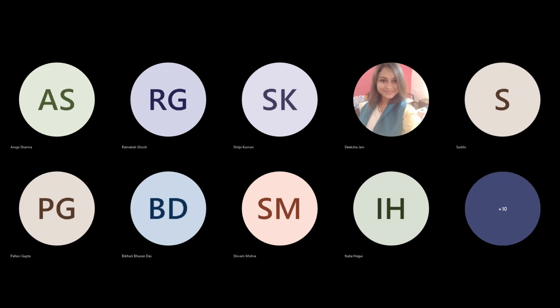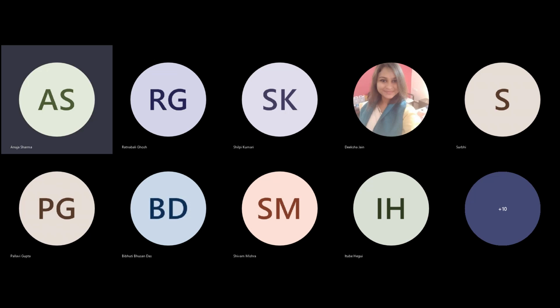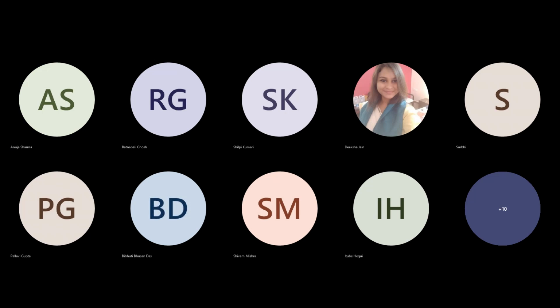Because if the ATG is present in front of the histidine tag, and we are cleaving it off, the start codon would also be cleaved off. It's not very clear. You want to ask that the ATG is present? Yes, should we clone it with ATG? Because I have not added ATG. I thought ATG is already present in front of the histidine tag.